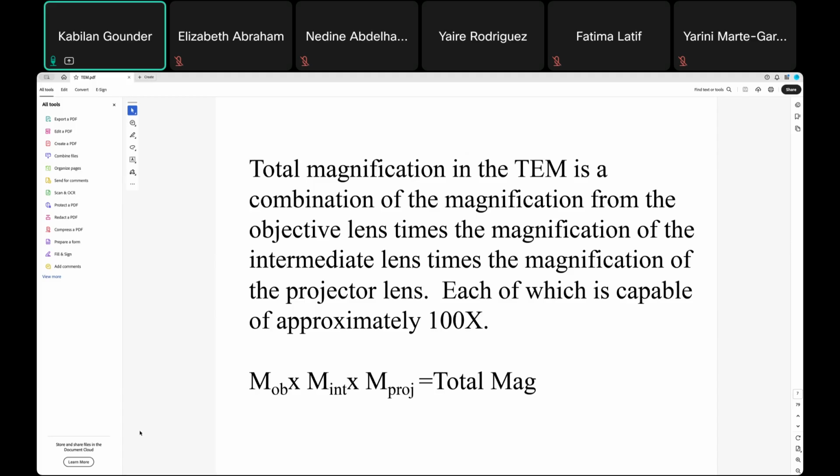When you put them side by side, if you are not telling anyone that this one was taken at 300,000 times magnification and this one at 400,000 times, they don't know, because it looks like both are the same size. But at the same time, to bring this to the level of the healthy one, we increased 100,000 times more.